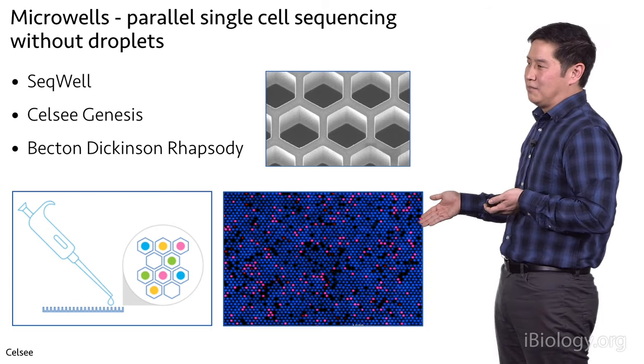Within this past year, a paper came out that had over a million cells processed in the study. And this study actually used a method called combinatorial indexing, which I'll go over next. With combinatorial indexing, you do a lot of in situ reactions, which means you use a cell as a compartment. You're not working with individual cells at any given moment, but you do multiple rounds of barcoding and mixing so that you generate combinatorial barcodes that will allow you to generate single cell data.